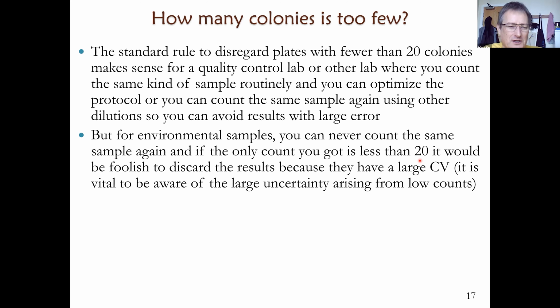You don't know how far below, but it's below this number of 1 CFU per total volume counted. That will become a little clearer on the next few slides.